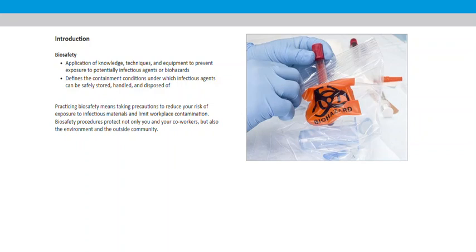Biosafety defines the containment conditions under which infectious agents can be safely stored, handled, and disposed of.